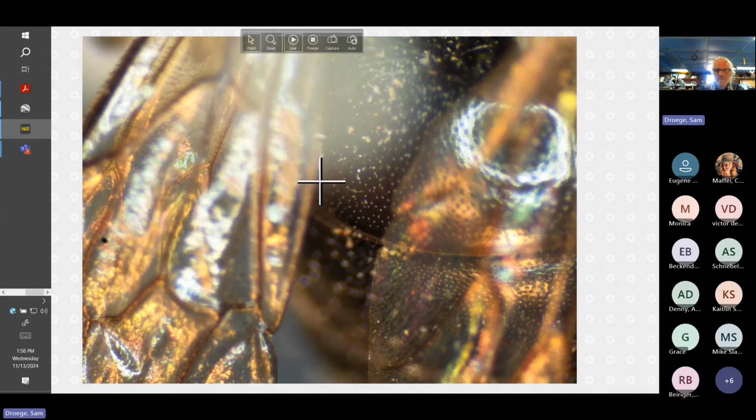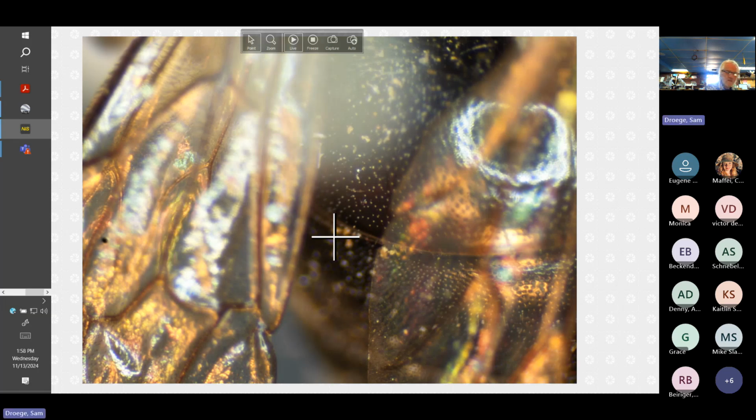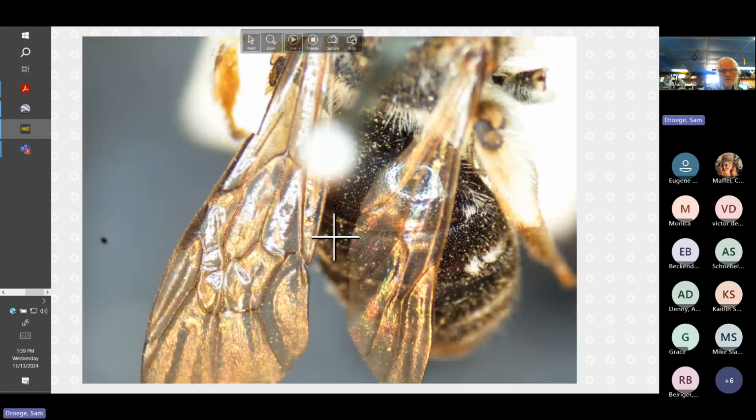Yeah. Look in here. While you are right there, on the sheet, like on the other notes on the species pages. Yeah. The, gosh, I just lost it. Clara's lost it. Okay, well, we'll get back to it. Sorry, I'll come back to it if I find it. Okay. All right. And totally with the wrong microscope.